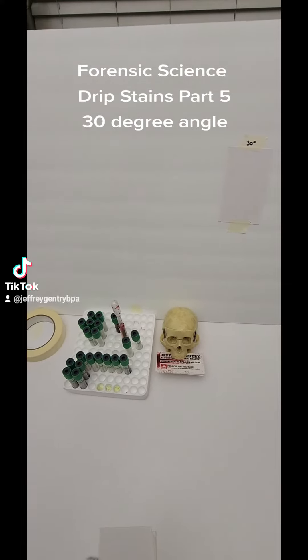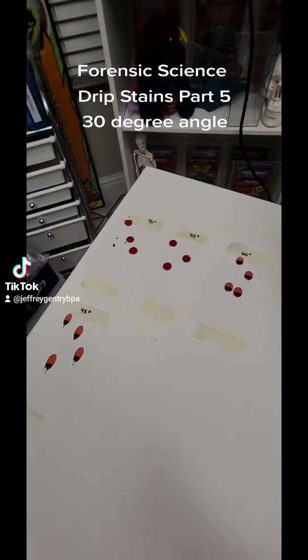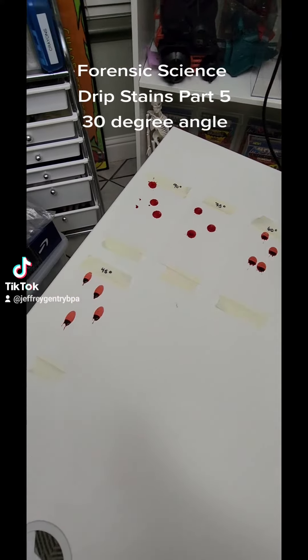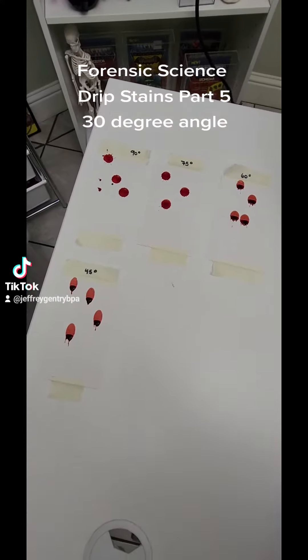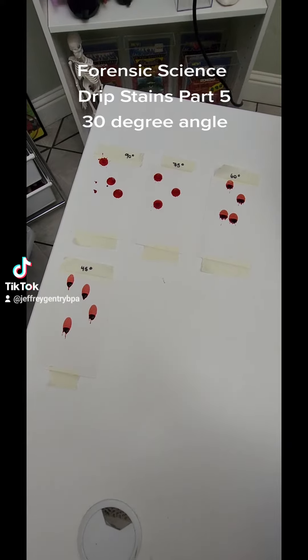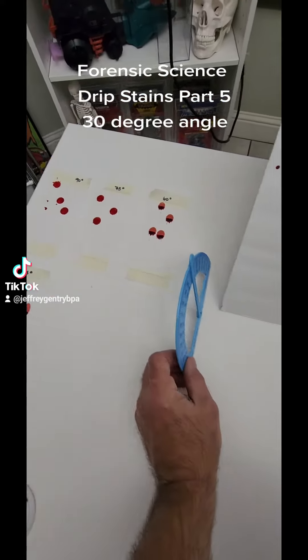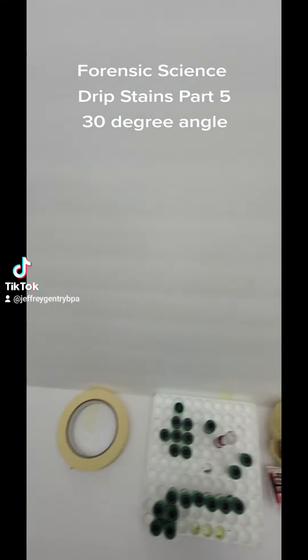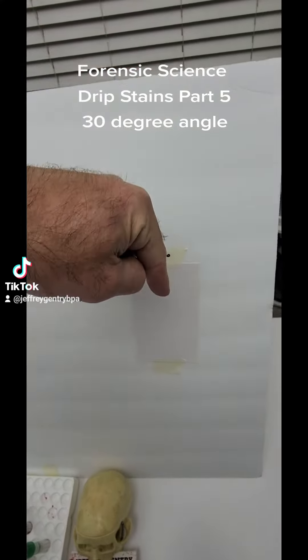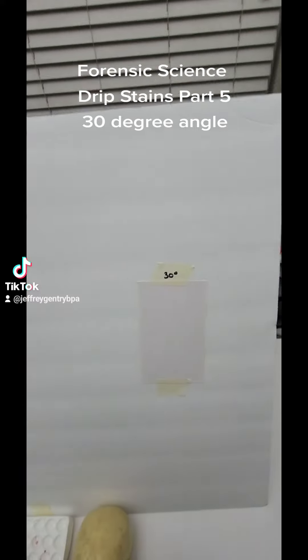The final one I'm going to do is the 30 degree drip stain. I've already created my 90, 75, 60, and 45s. As you can see, they become more elliptical in shape as you decrease the degree angle of impact. This is 60 degrees that my board is measured at, so that means my stain is going to hit the board at a 30 degree angle.